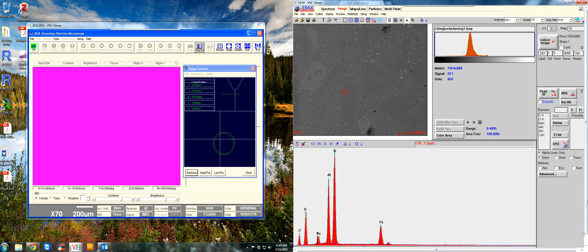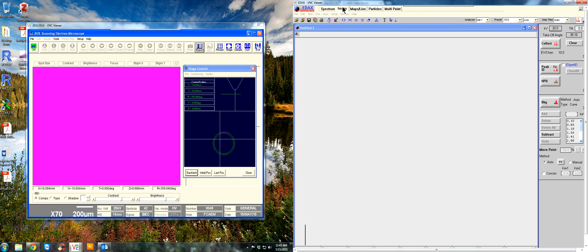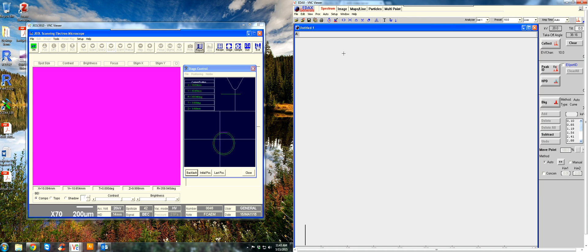So that's the last thing I wanted to mention with the image tab. Now, the spectrum form of quantitative analysis is you'll just get an Excel file with the raw data and you can do some changes. We're basically going to take an analysis in the same area, this point right here, and you can save this file separately. Let's call this plagioclase 1.